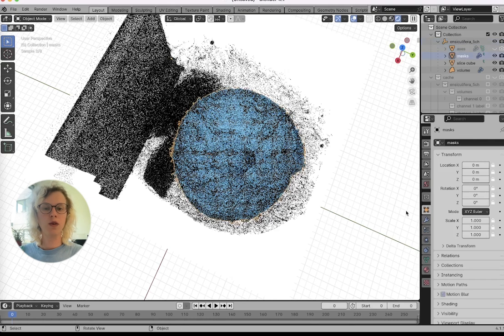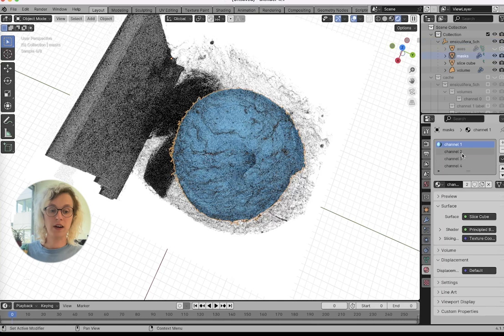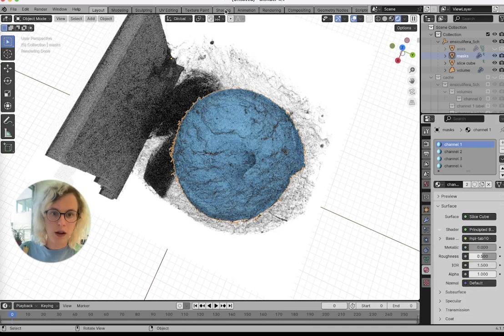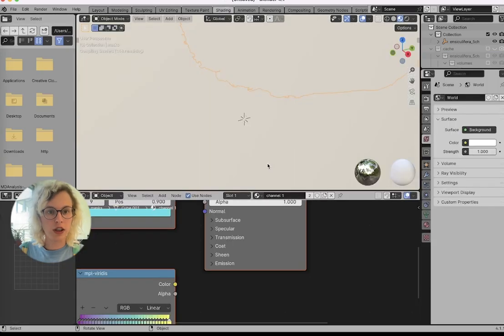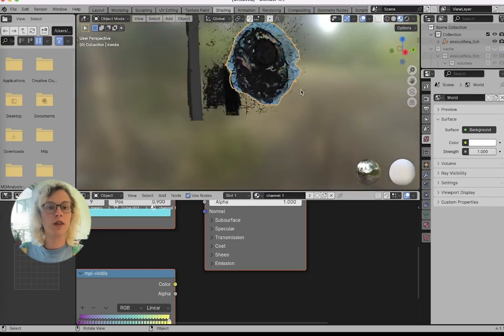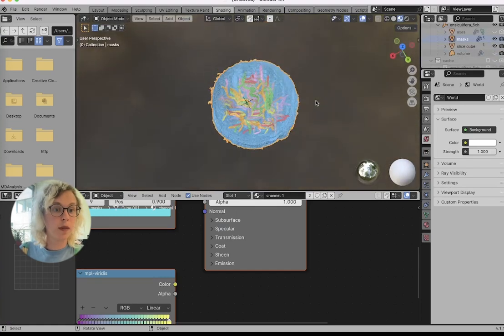The masks all get loaded with a revolving color map per object ID. So they all have the same color map on load, because the assumption is that you also want to be able to color things per object ID. So let's look at these shaders for our masks. Here we're in this faster view so that the volume doesn't get rendered as complicatedly, and we can see our different masks. We can also just turn off the volume for now.